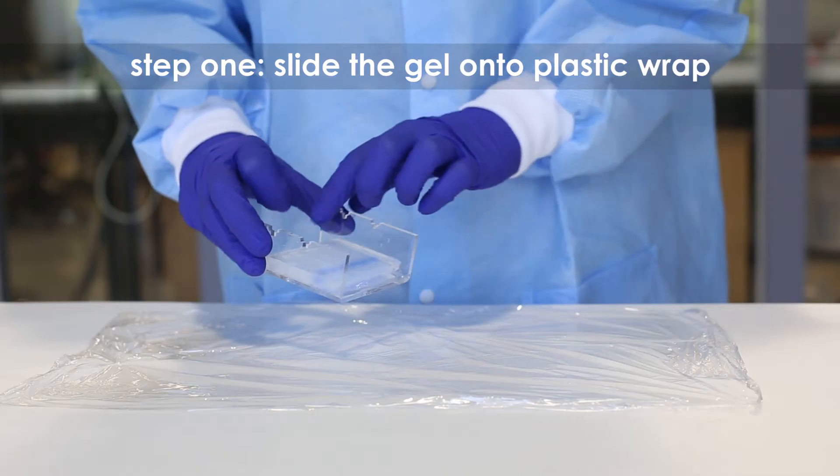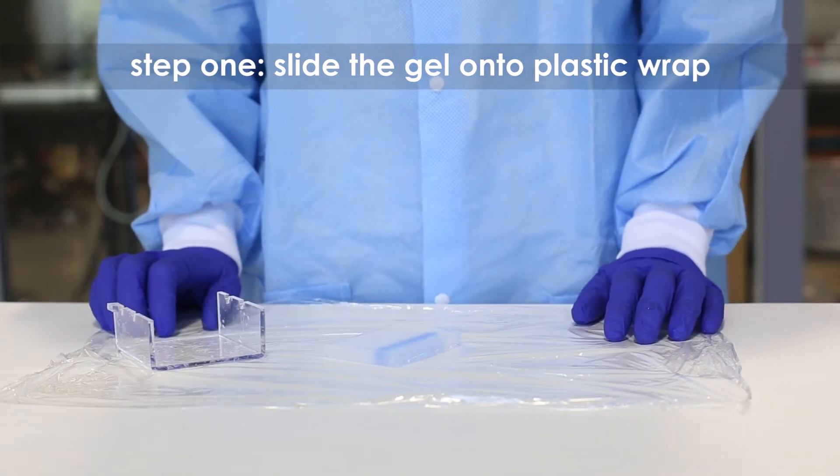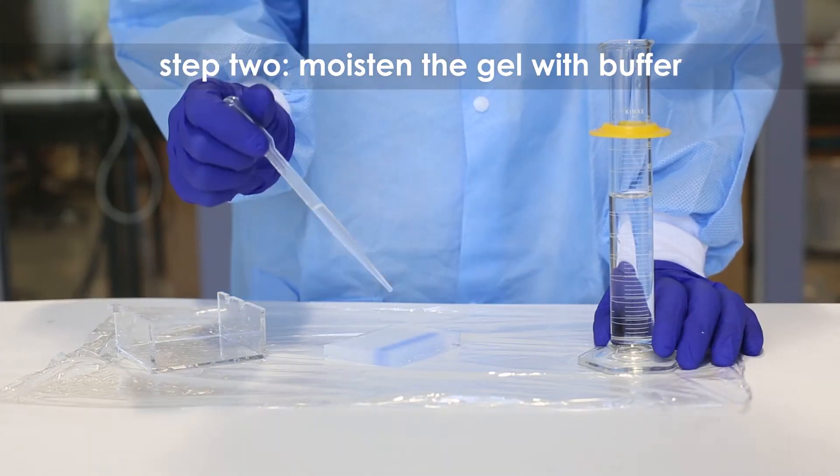Step 1: Slide the gel off of the casting tray onto a piece of plastic wrap on a flat surface. Step 2: Moisten the gel with a few drops of electrophoresis buffer.